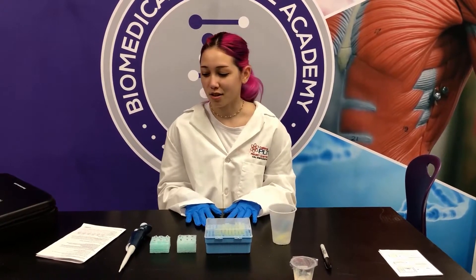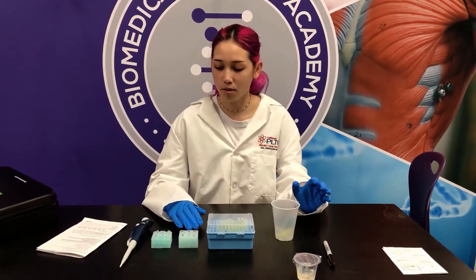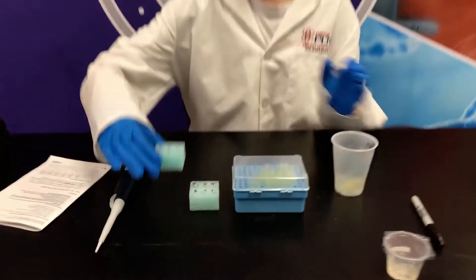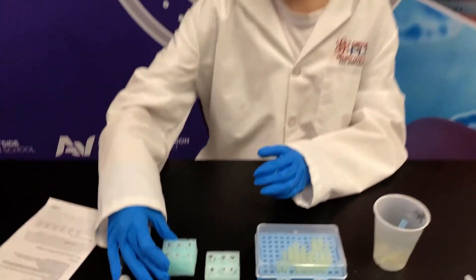Hi, I'm going to show you how to perform the DNA Detectives lab. First we're going to make sure that we have all the materials needed for this lab. I've already labeled the six tubes one through six, and now we're going to set up the restriction digest.